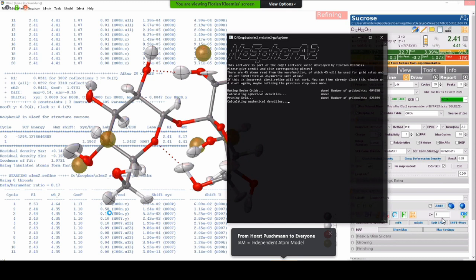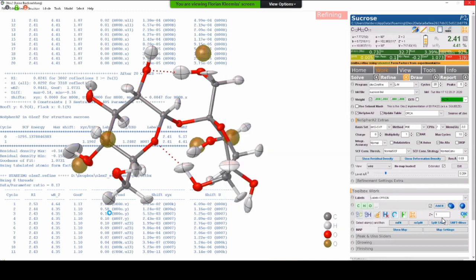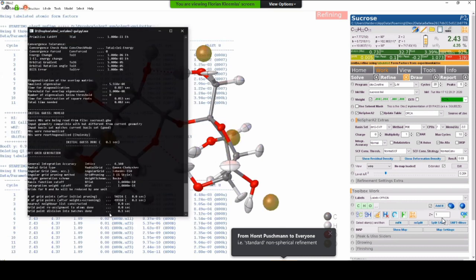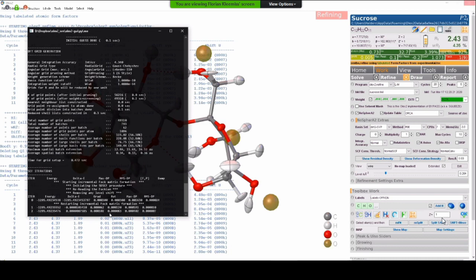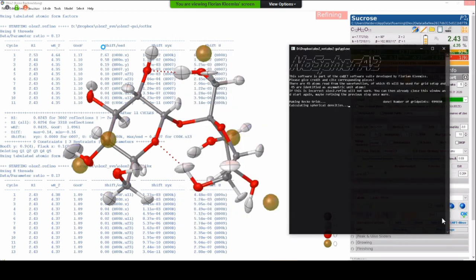But if you think about it now, each least squares step becomes just one cycle in this iterative procedure of Hirschfeld atom refinement, where we calculate the TSC again. So what we do is we save the old geometry and ADPs, we save the new geometry and ADPs, and we compare how much shifted between the full least squares step. So it's a different kind of table in the end, which is basically the sum of all shifts in the least squares. And this way you have to think in two ways.